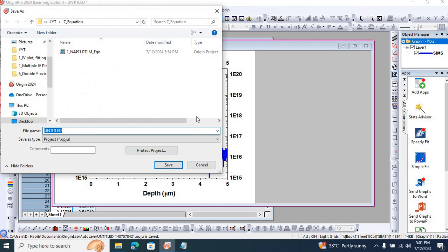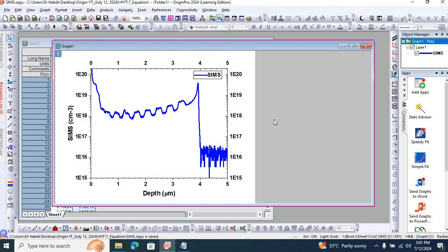So I'm going to save this project as SIMS, and I'm going to move on to the next one.